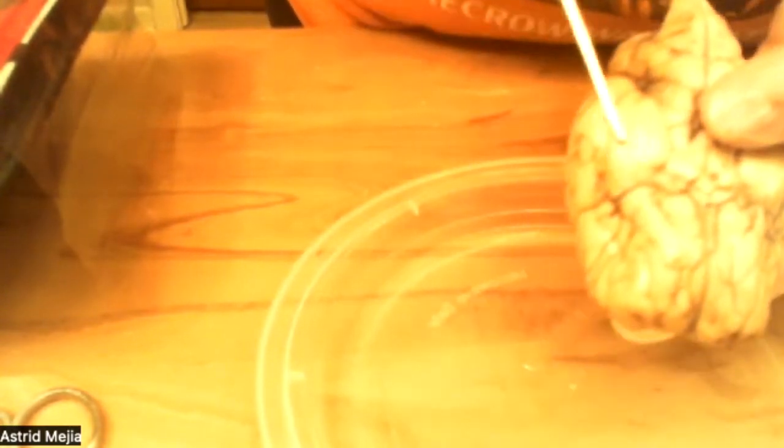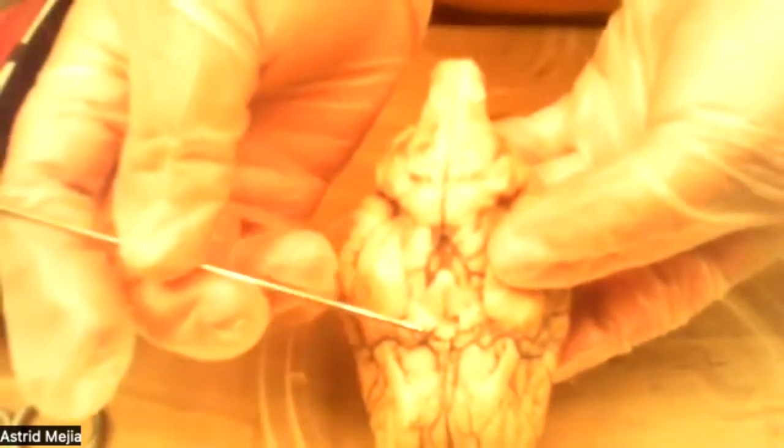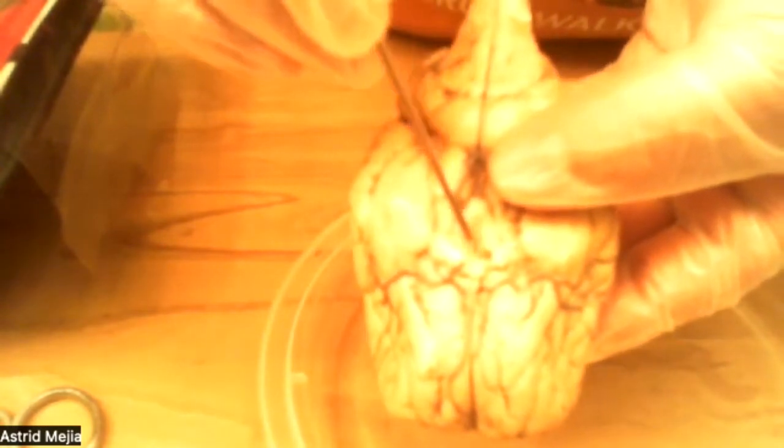This specifically connects the olfactory bulb to the remainder of the cerebral cortex, which creates a direct connection between the sensory output and the olfactory neurons. And then we're going to see the optic chiasma, which is basically the middle part of it. My bio teacher basically hinted at it, where it meets in the middle, it makes like a little X. You can't really see it through here, but it would be basically this part where it forms an X.